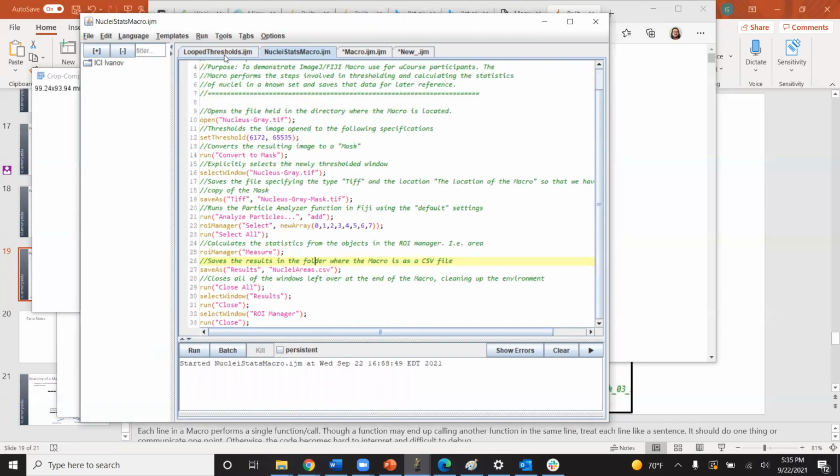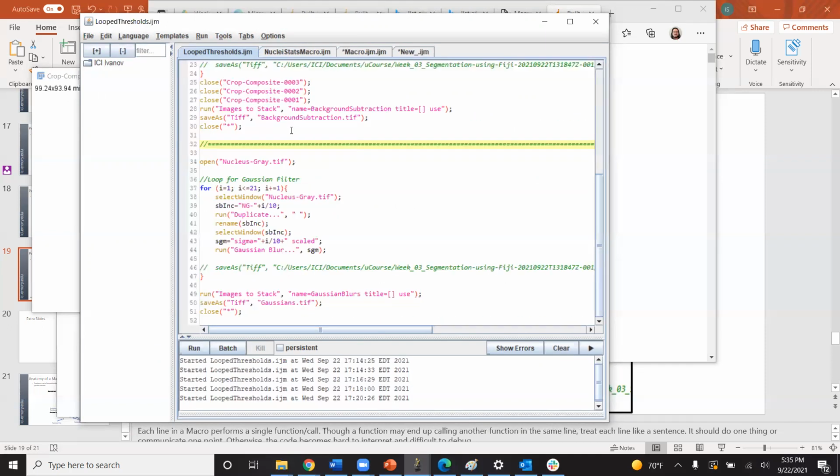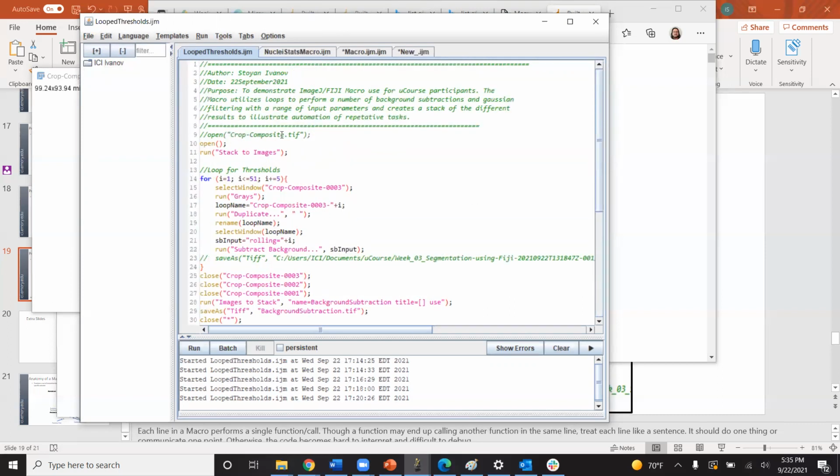Just to make sure that I understood it in the right way. So is it something like we are programming it in a way that it automatically duplicates the image and then applies the threshold of whatever we ask it to, like 5 or 10, and then on that duplicate image, and then again duplicate it and apply a threshold of say 10 this time, and then again duplicate it and apply a threshold of increment say 15 this time, and then at the end combine all the images together?